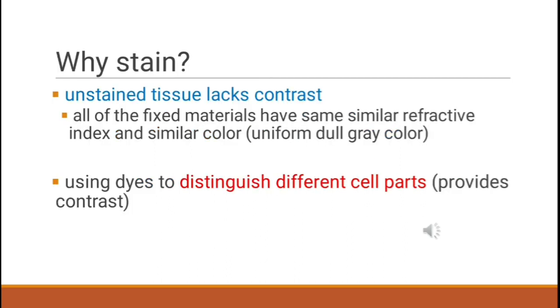Now I'm gonna ask you a question: why do we need to stain? The most basic reason that cells are stained is to enhance visualization of the cell or certain cellular components under a microscope. The major importance of staining is to increase or improve visibility and also to study specific features such as the morphology. That includes the shape, the size, and identification, structural details, and as well as its composition.